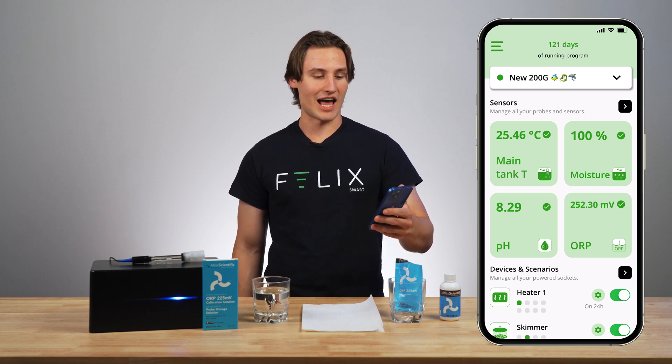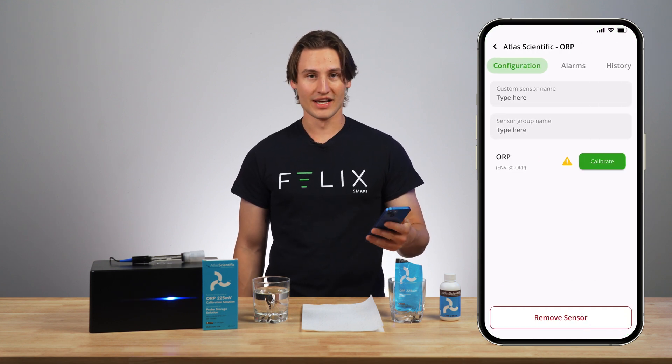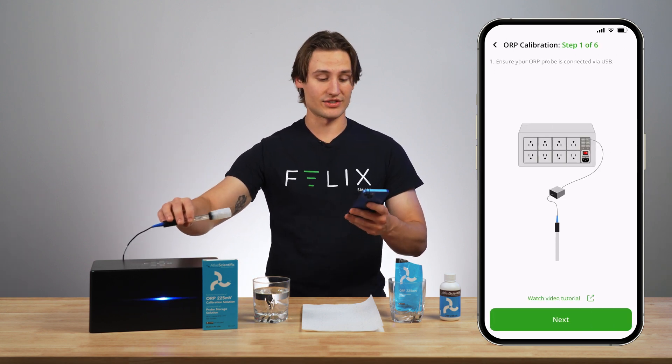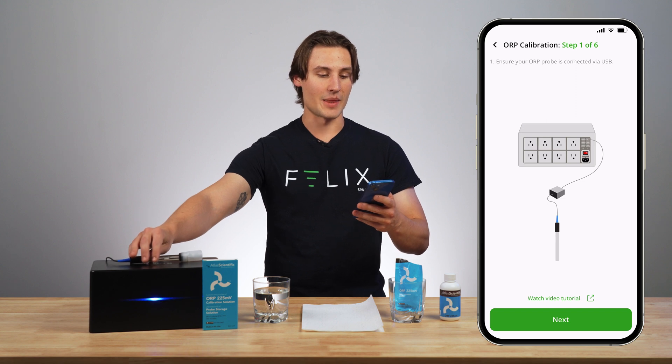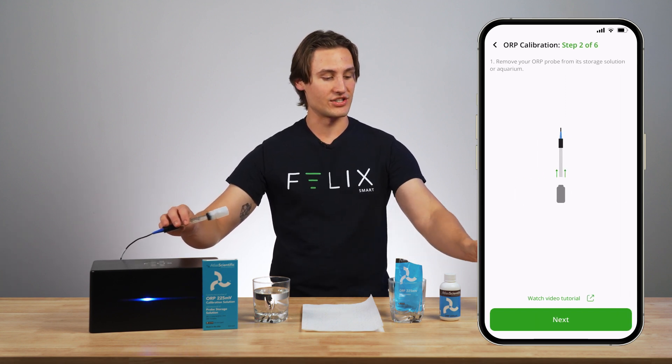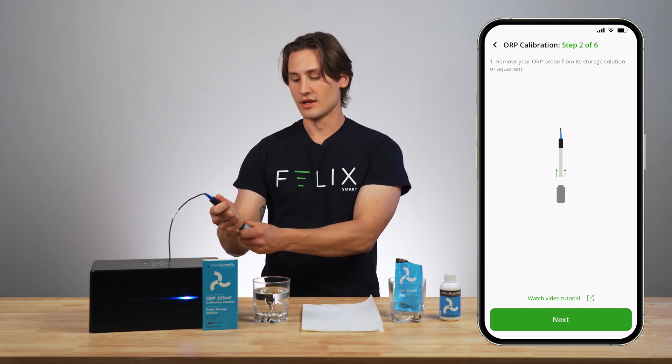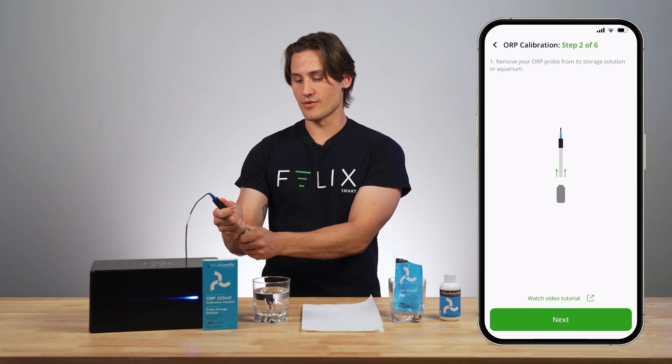I'm going to go here and press calibrate, which is at the very bottom of the screen. Now it says ensure your ORP probe is connected via USB, which mine certainly is, so I will click next. And then I will remove my ORP probe from its storage solution, or my aquarium if I was recalibrating this probe, but this one is brand new so I will just lightly wiggle this out.